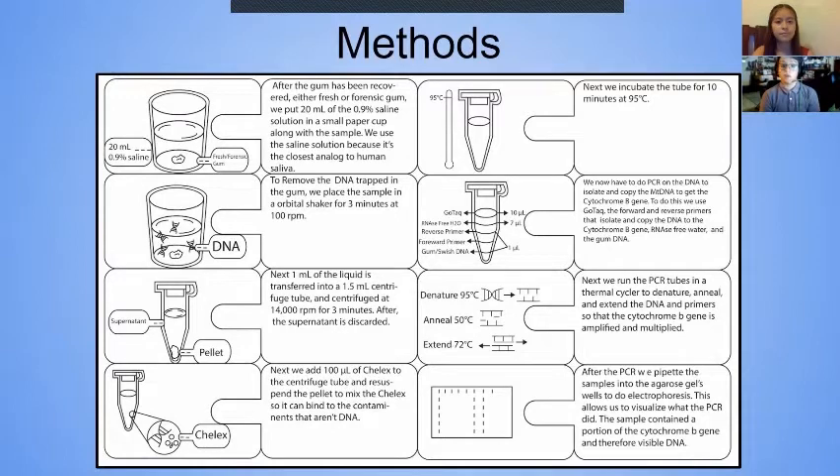Once the contaminants have been removed, we start the process of PCR. To show our results, we use electrophoresis.